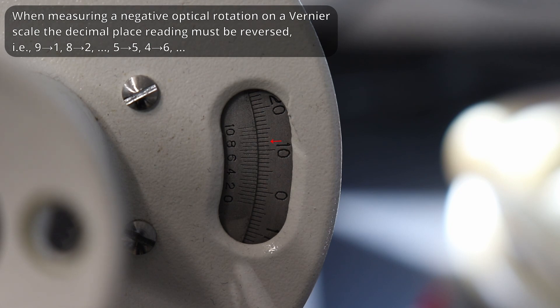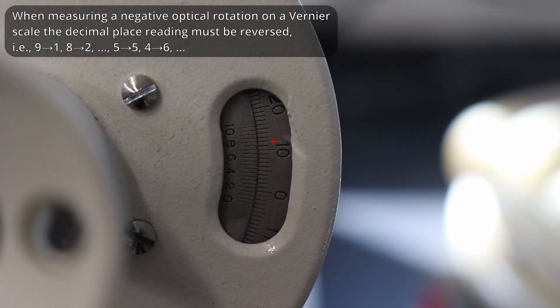However, since we're reading a negative value off the vernier scale, 8 actually becomes 2. And this is the same with the other numbers, so 7 becomes 3, 6 becomes 4, etc.